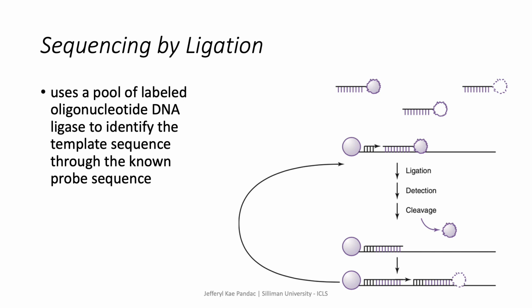Sequencing by ligation, which is another format of NGS, is used in certain research applications. Sequencing by ligation uses short fluorescently labeled oligomers that hybridize in short increments if they are complementary to the DNA template. The template DNA anchored to a glass slide is flooded with fluorescent labeled oligonucleotides. If the oligo is complementary to the template, it is ligated and then two bases are detected at a time. The oligonucleotide is cleaved, followed by the next round of ligation.